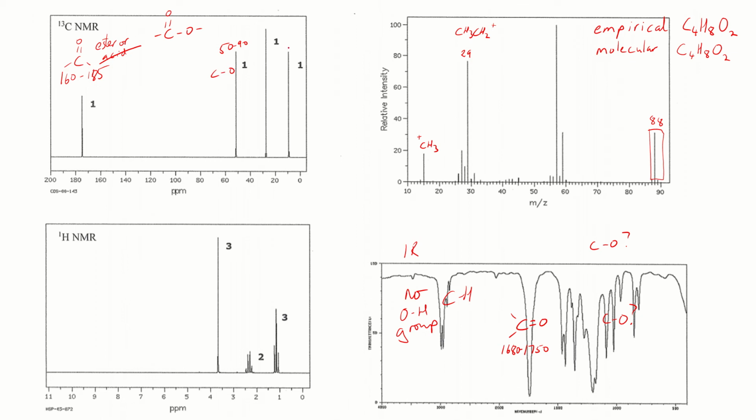As for these two, both down in that 5 to 40 region pretty much, or 20 to 50, we could say for this one. So we're a little bit unsure whether or not this is either the carbon next to the C double bond O here, or if it's just a C bonded to an R group essentially. So we'll come back to these two in a moment.